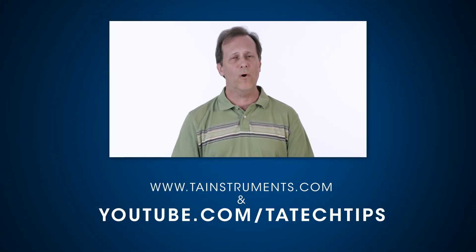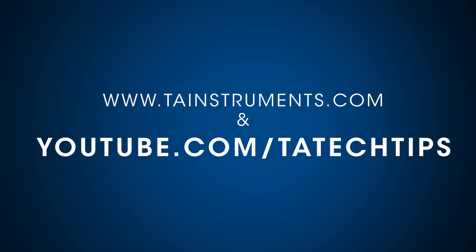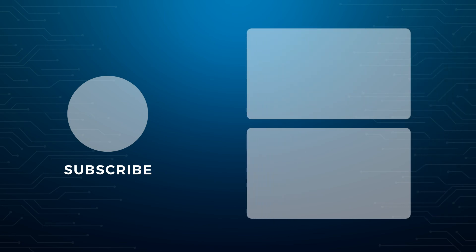In this tech tip, we discussed how to change the sample and tear hang down wires on a Discovery 5500 TGA. Please stay tuned for more helpful tips from TA Instruments and thank you for your interest.